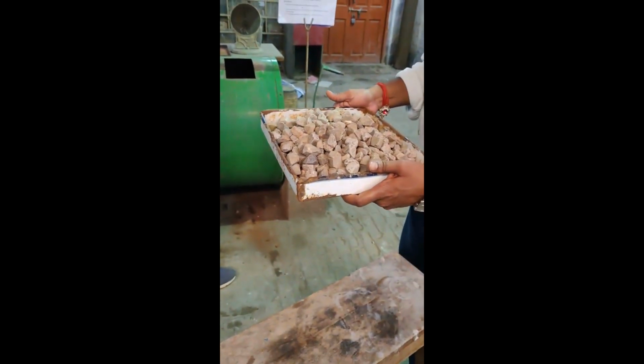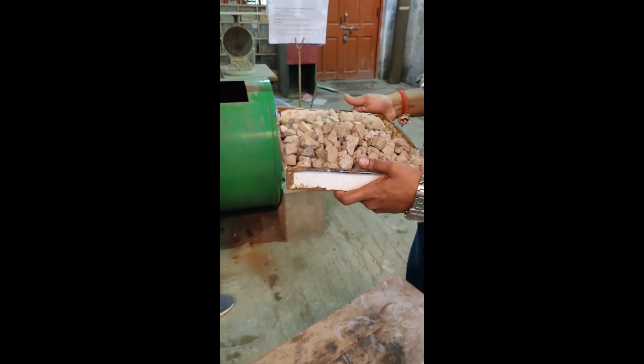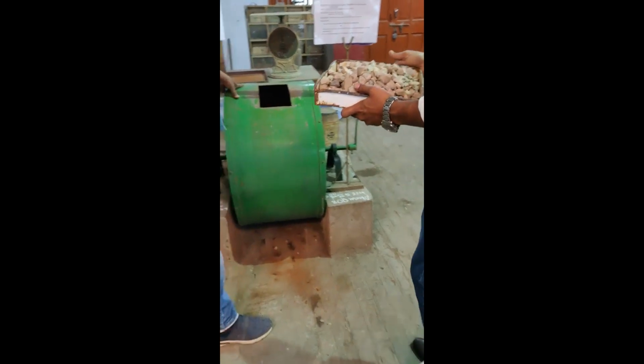With the 5 kg of raw material limestone, we are going to check the tumbler index. Further, we are putting this material into this drum.